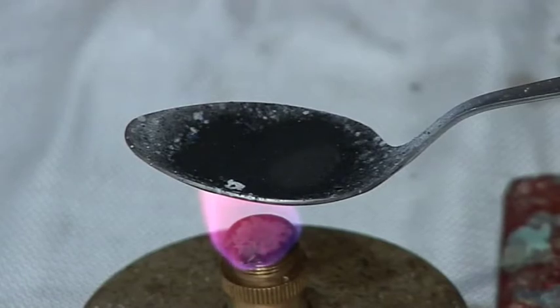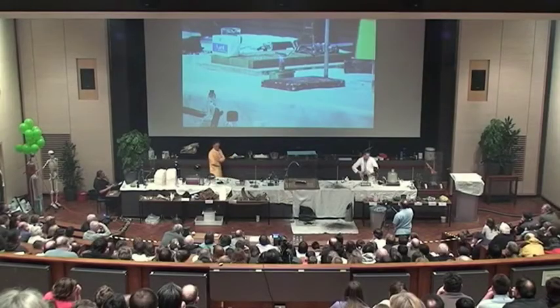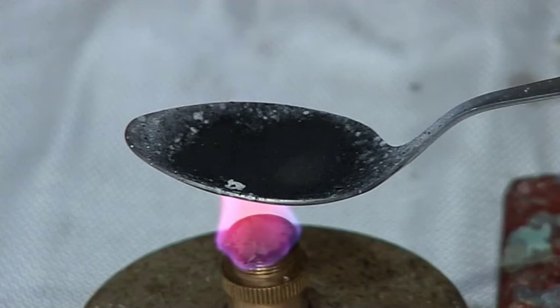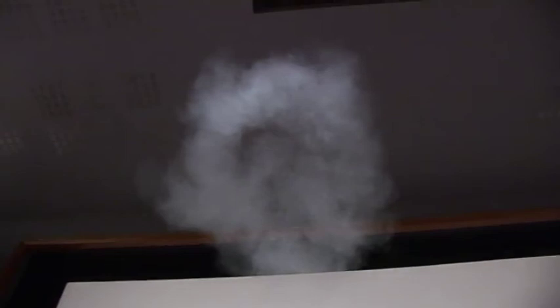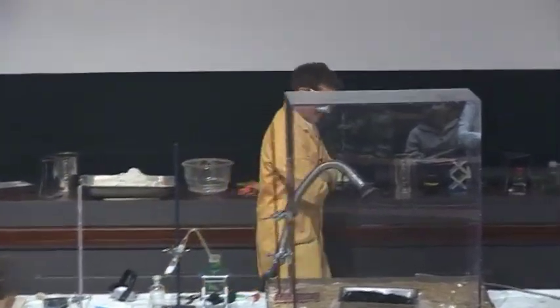It's beginning to smoke a little bit, so maybe a reaction is going to happen any second. Watch carefully — it's beginning to smoke. What's it going to do? Is it going to go? Still smoking. There we are — and look at the beautiful smoke ring, as if it was planned. Notice that it did not go bang. There was no bang.